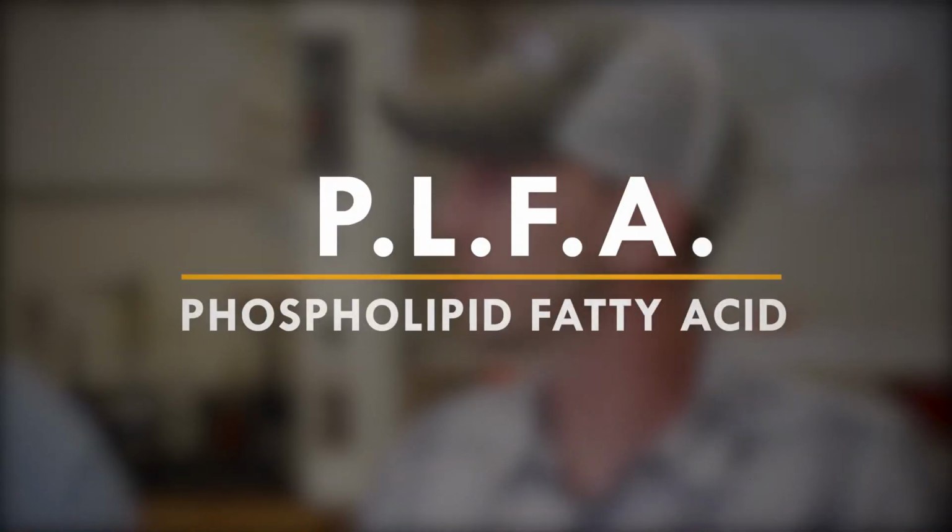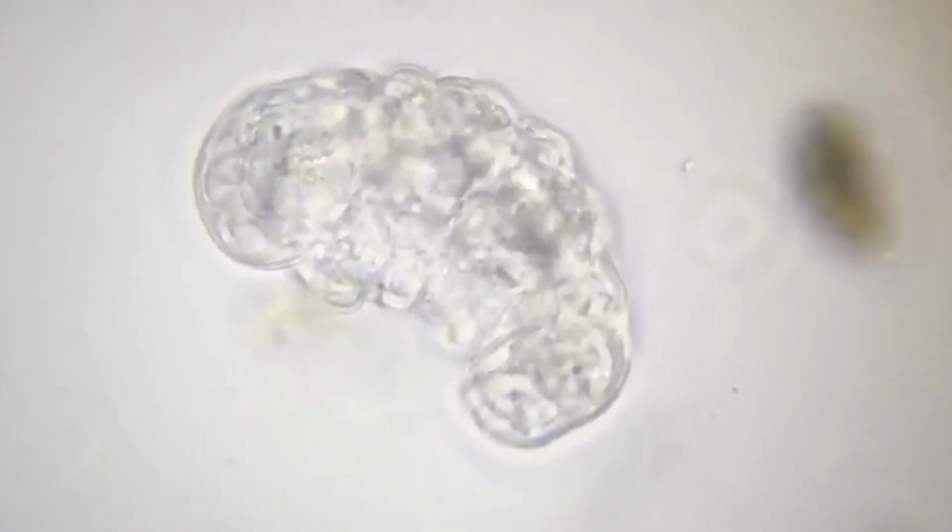So PLFA is a biological indicator test, and PLFA stands for Phospholipid Fatty Acid. And these are fatty acids that are cell membrane components of any type of cell. And it's important that we use these because they degrade faster than many other cell membrane proteins. So when we're measuring them, we get a more accurate measure of living components instead of just some cell membrane debris that's left that's dead.